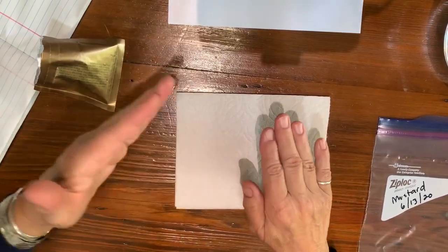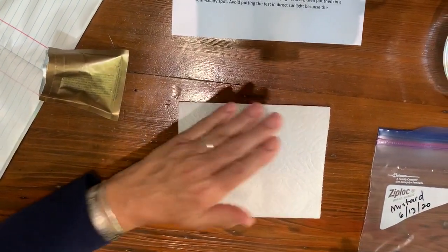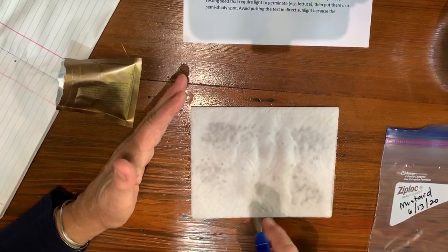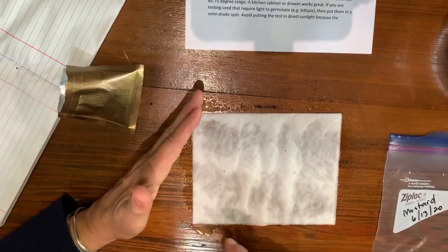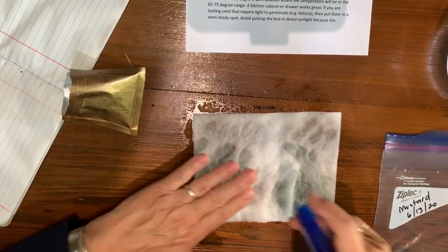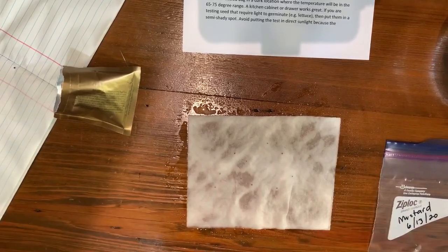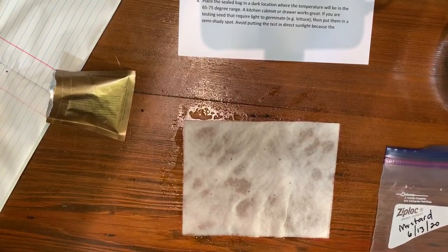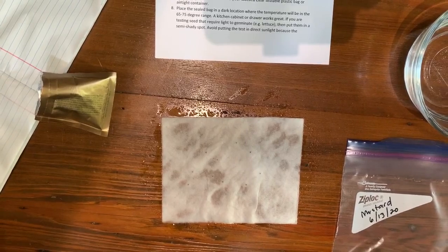Now moisten the paper towel. It says to use a mister. How moist does it need to be? It needs to be pretty moist — we want to keep the seeds moist the whole time they're trying to sprout or germinate. So that was number six. We've done that using a mister bottle. Next time we're going to do the alternative where you wet the paper towel and squeeze out the excess.